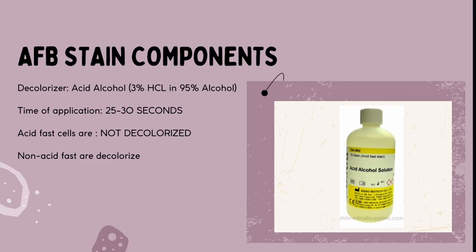Next, we have your decolorizer. This is the component that is being resisted by your acid-fast bacteria, because of the content mycolic acid, which is lipid in nature. And lipids are strongly hydrophobic in their characteristic.